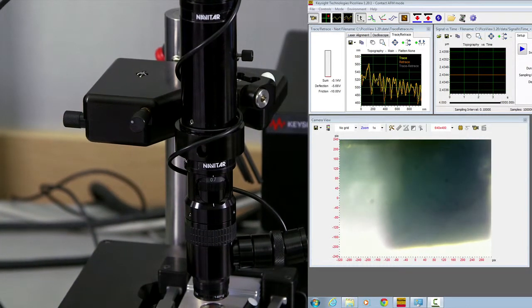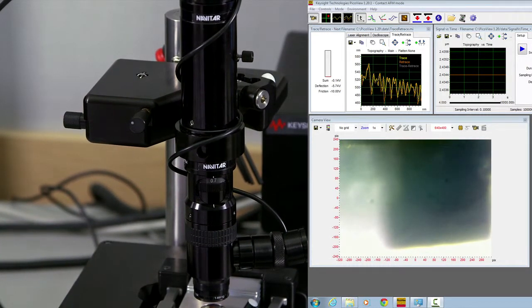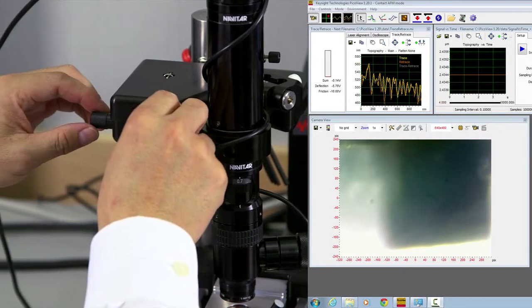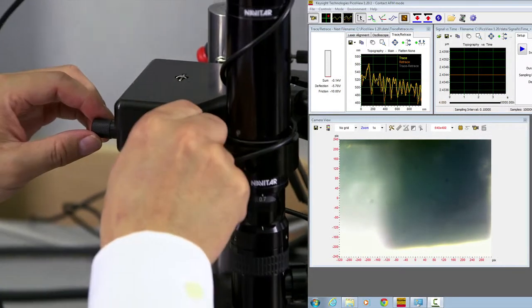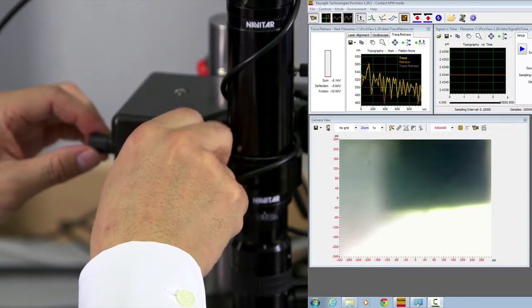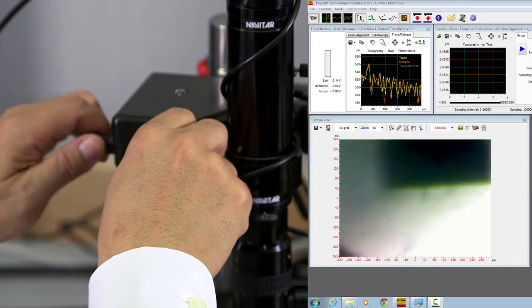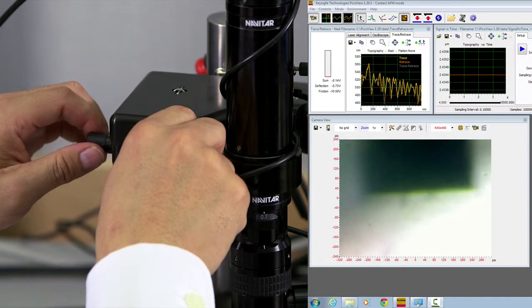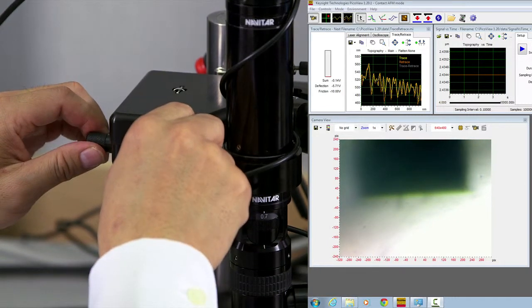There are two knobs to adjust the XY translation of the optical microscope. You can look at the screen and adjust the translation until you see the brief shape of the cantilever tip and then translate them into the center of the optical view.